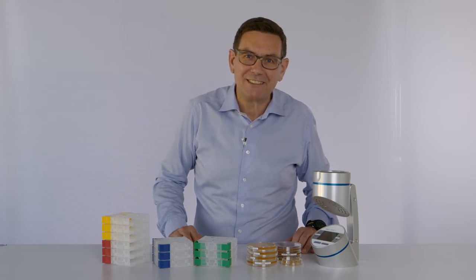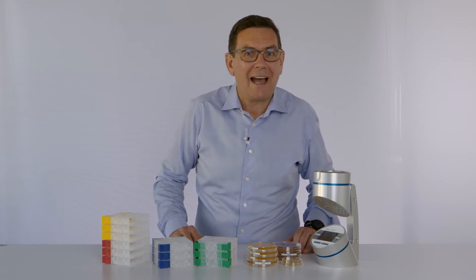Do you find it difficult to keep your Petri dishes in order? If so, I have an idea for you.